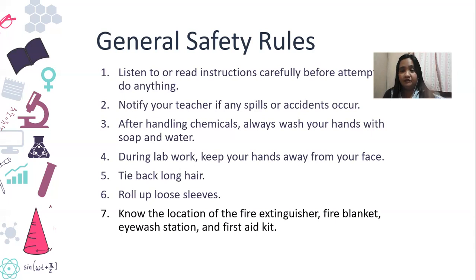Know the location of the fire extinguisher, the fire blanket, the eye wash station, and the first aid kit. We have all of them except the eye wash station, but for the laboratory, we have sinks positioned strategically inside the laboratory.